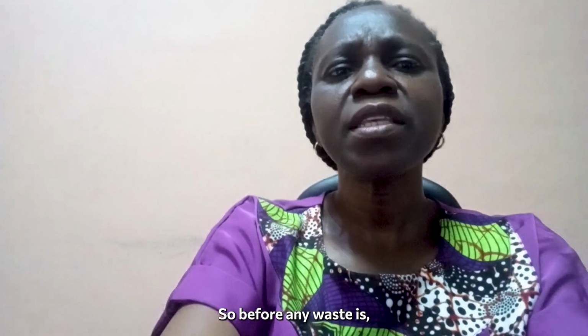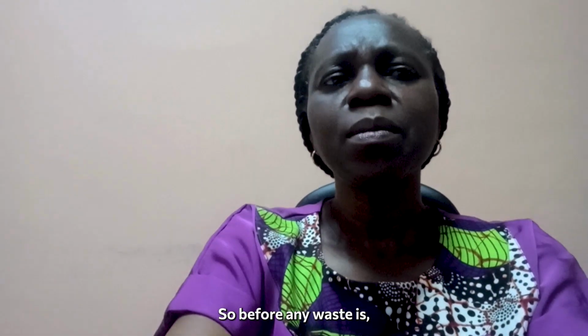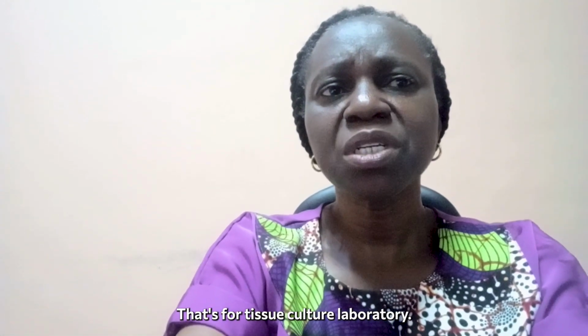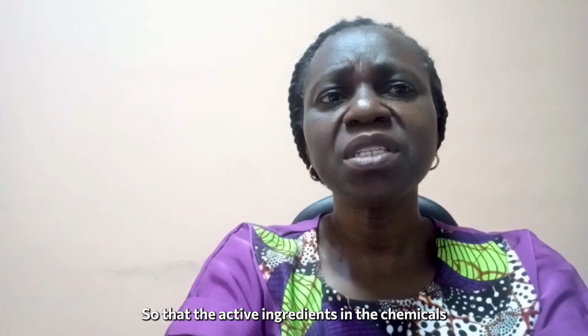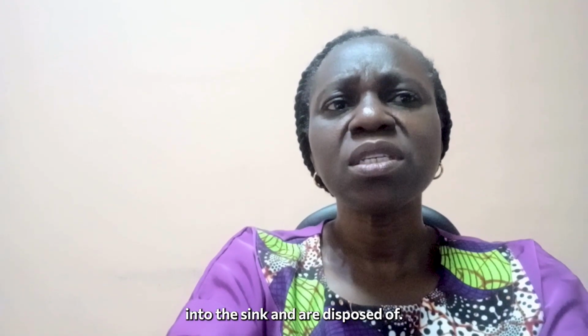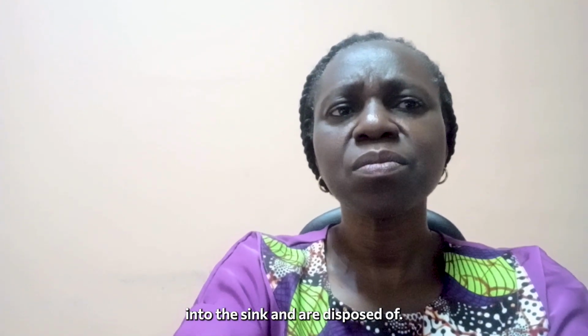So before any waste is disposed of, it must be autoclaved. That's for a tissue culture laboratory, so that the active ingredients in the chemicals are broken down before they are thrown into the sink and disposed of.